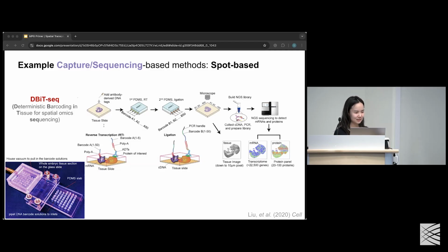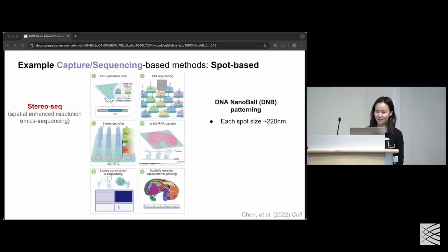One thing I didn't mention is that StarMap has hydrogel embedding as well, and they do very mild expansion and also tissue clearing to help with the imaging. In the case of dbit-seq, I don't believe it's there yet, but I think all technologies at the end of the day are striving to get there at some point. Thank you for that question.